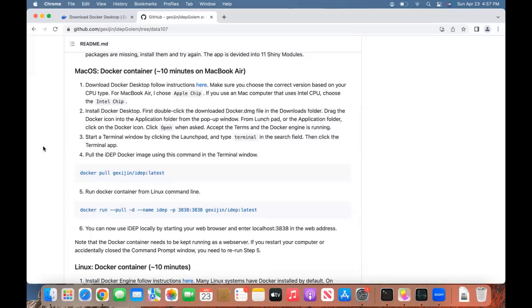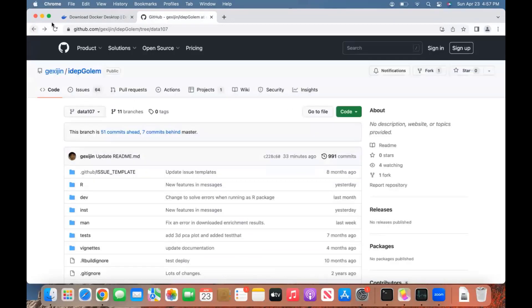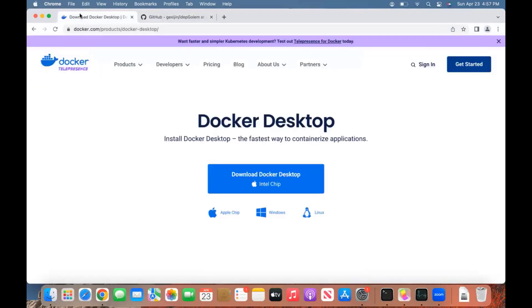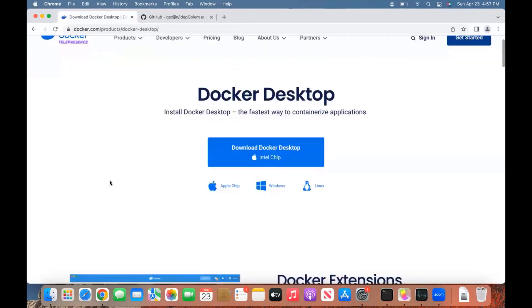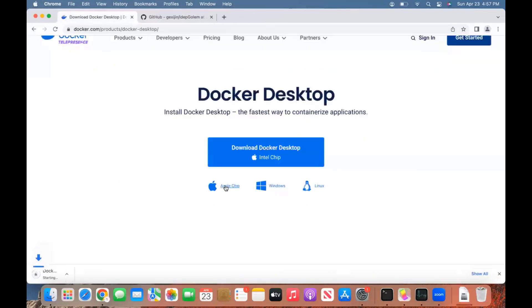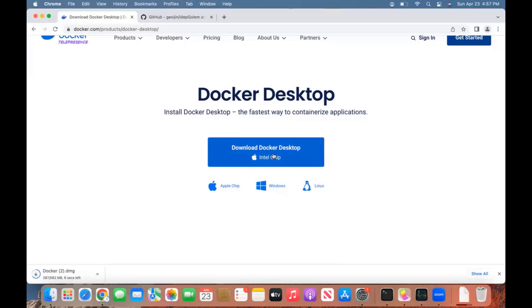To run iDEP locally through a Docker container, first we're going to install Docker Desktop. Since this is a MacBook Air M1, this is an Apple chip, so make sure you download this file. If your Mac is an Intel chip CPU, make sure you choose this.